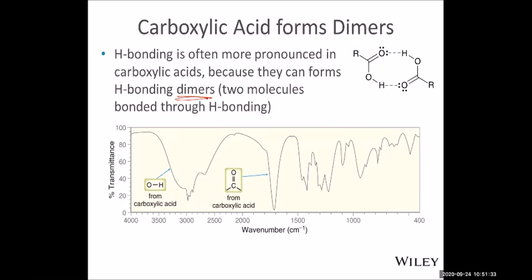And then you look at the region still around 3000. These are abundant. You have two methyl groups. The methyl group has carbon-hydrogen single bonds, and the carbon is sp3 hybridized. So we should expect fairly strong absorption because it's six carbon-hydrogen bonds. Very strong, but this should still be weaker than the OH bond.